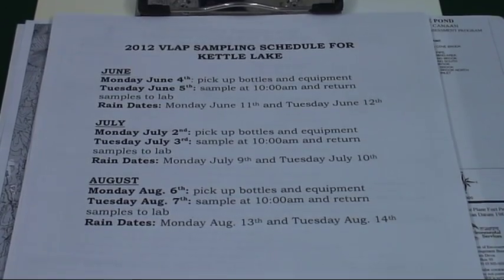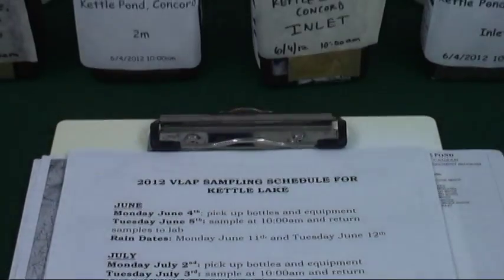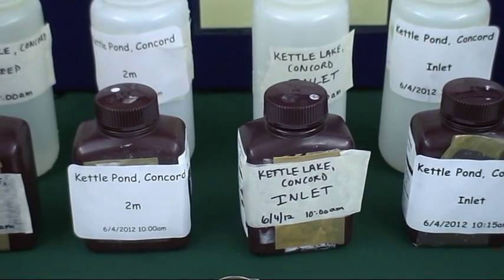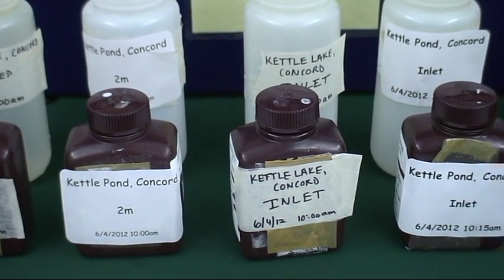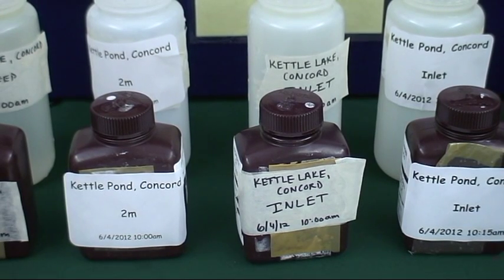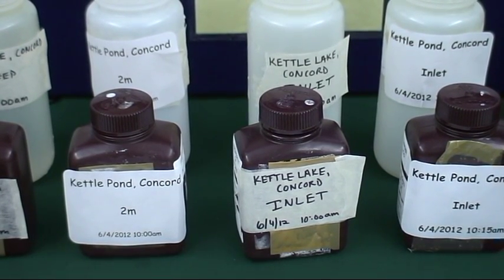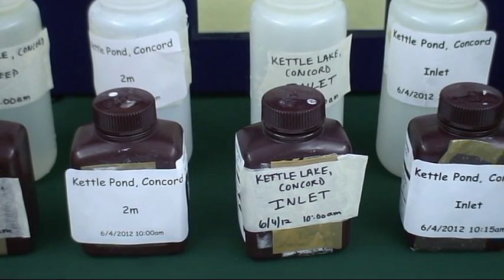Once your monitoring schedule is in place, you'll want to be prepared for your sampling trip. Be sure to check the weather report. Do not sample during thunderstorms, tropical storms, or hurricanes. Do not sample during extreme fog or high wind conditions. Safety comes first, so please follow all boating regulations. If you have your sample bottles already, pre-label them before you head out. You can print labels from the computer or label with a waterproof pen marker. Remember to label the bottles with the lake name, the town, the station name, and the date and time you sampled. You may consult your sampling station map for a list of station names and locations.